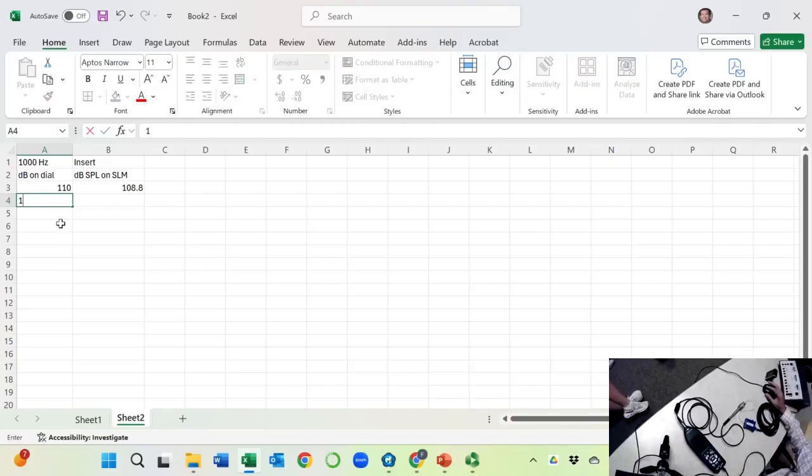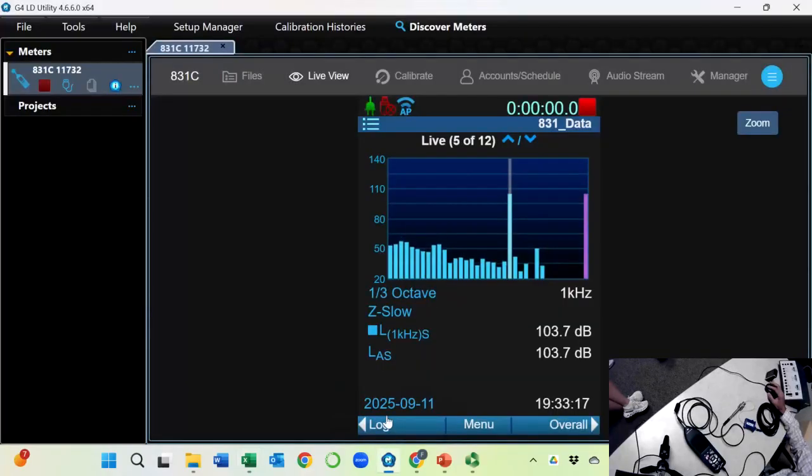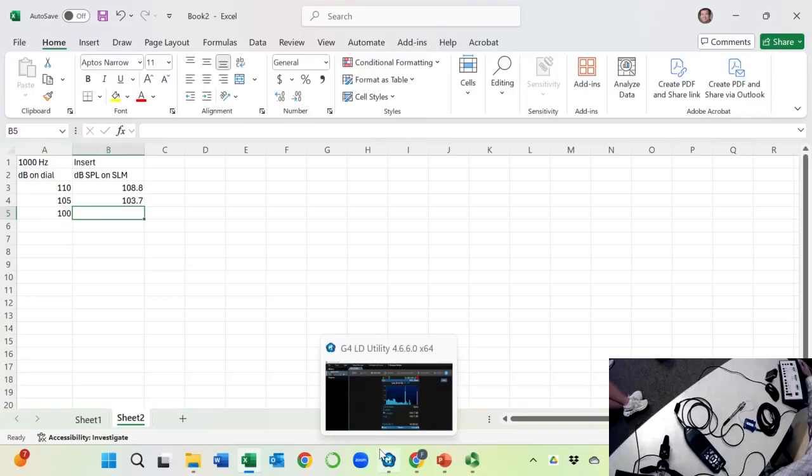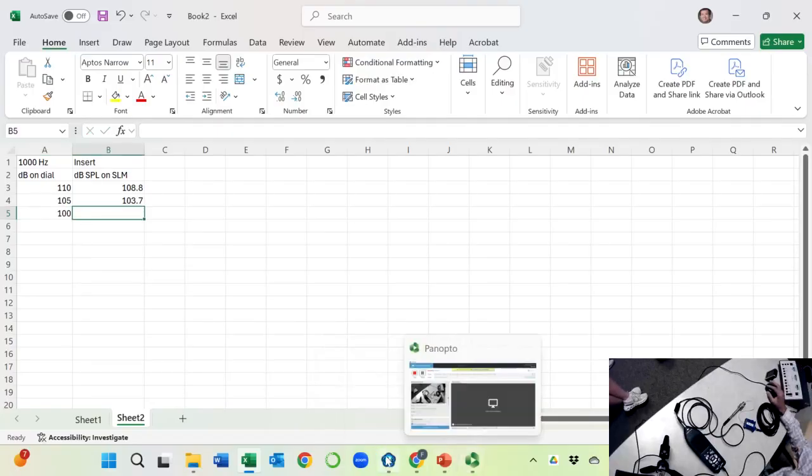So now the dial is 105. What's the reading? 103.7. And I'm going to continue. The other way, 100.